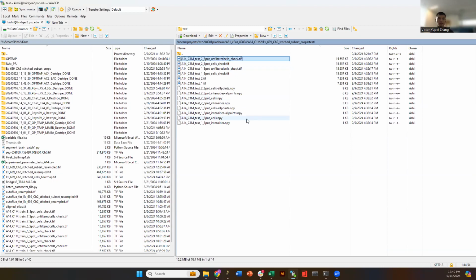So I think that's it. Once you're satisfied with the classifier, you can go to the next stage. You just have to make sure that you change some of the parameters that we just went through, but everything else should be identical to the way you've been doing it. So I hope that helps.